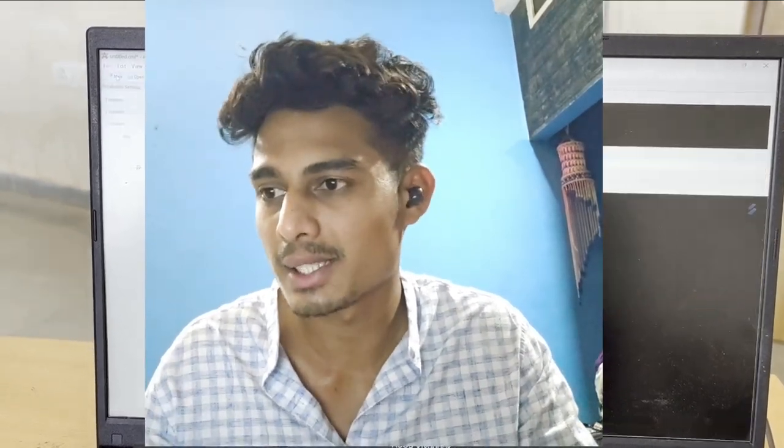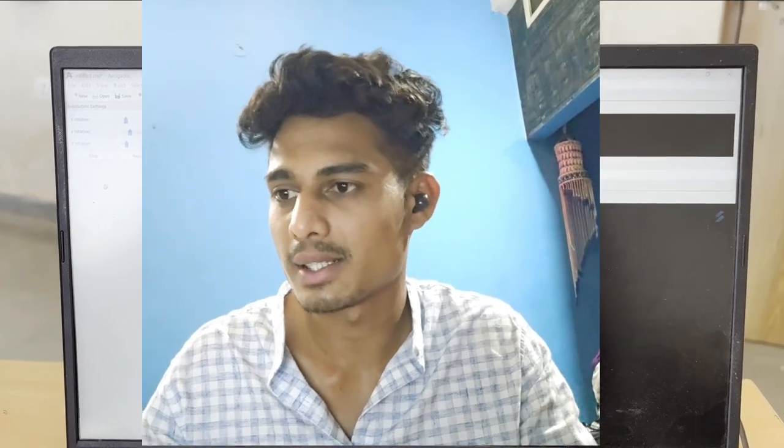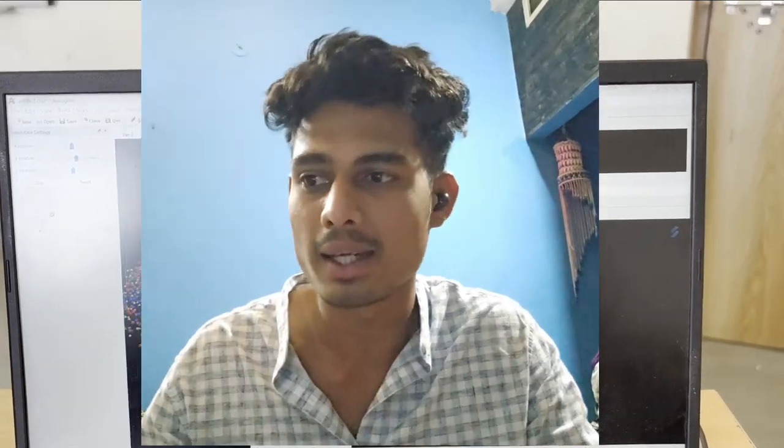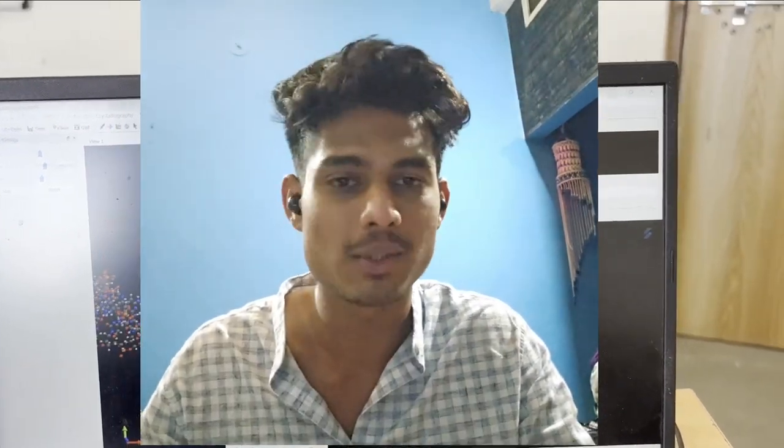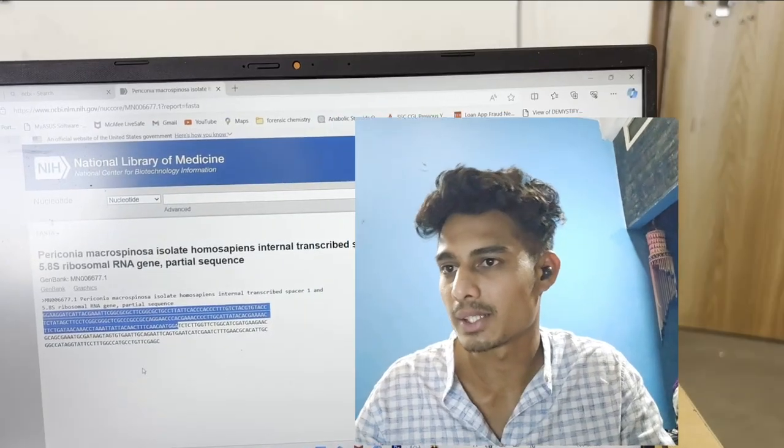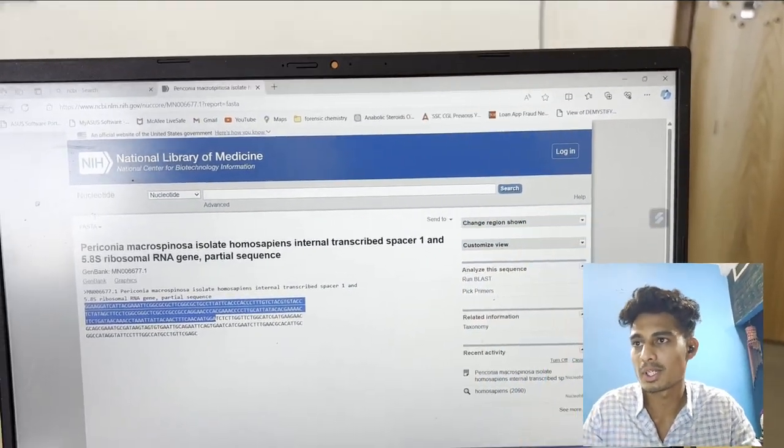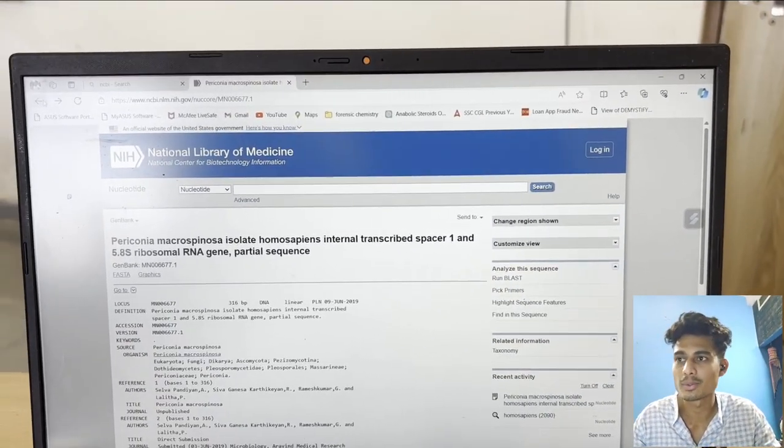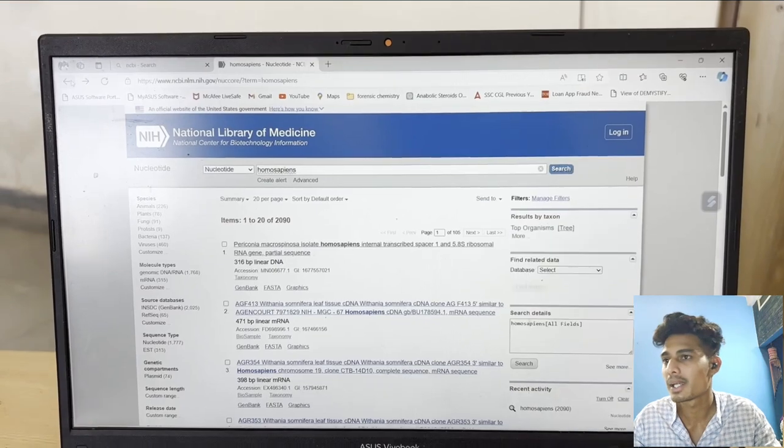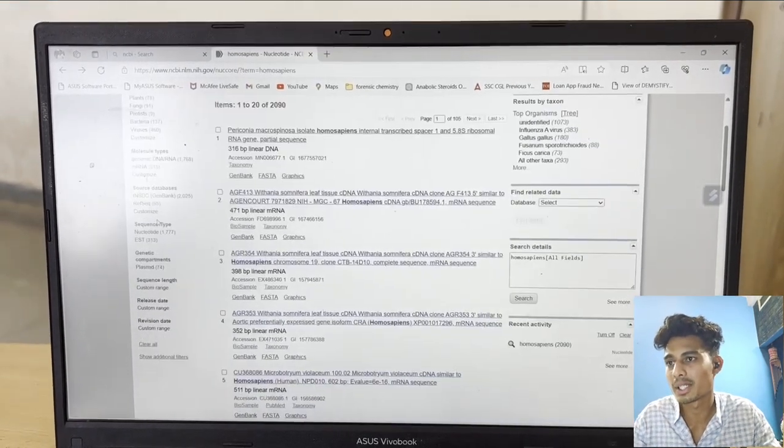NCBI is basically a website and database where we can get nucleotide and genome sequences. We are going to use this website first. All databases are here.